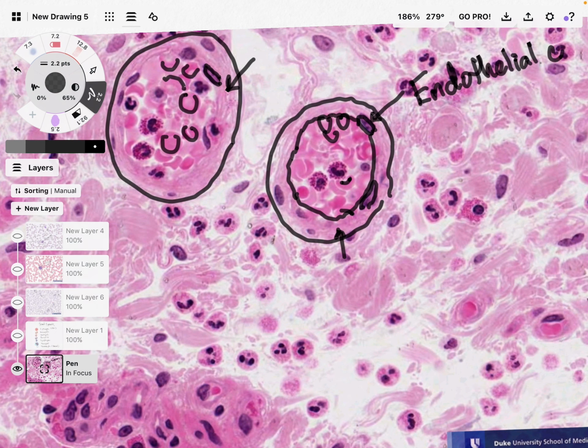All right, endothelial cells are a special type of epithelial cell, and these are squamous cells. I will do a video when I talk about epithelial cells and how to distinguish between a cuboidal versus a columnar versus a squamous, and even the different arrangements of those things. But endothelial cells, squamous cells tend to have flat, irregular shaped nuclei, because it is a flat, irregular shaped cell, right? So the endothelial cells that line the blood vessel are squamous cells, and you can see they have these flat, irregular shape kind of nuclei.